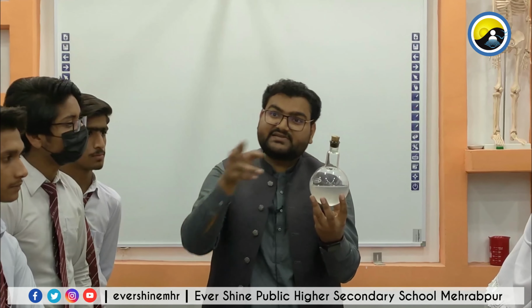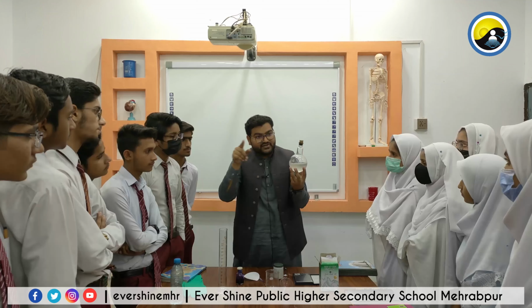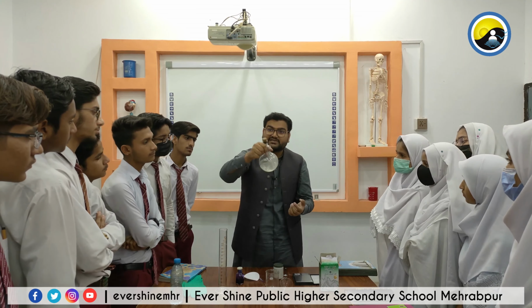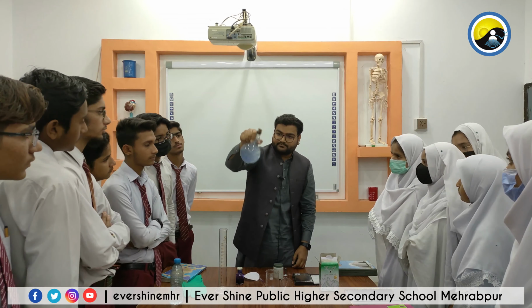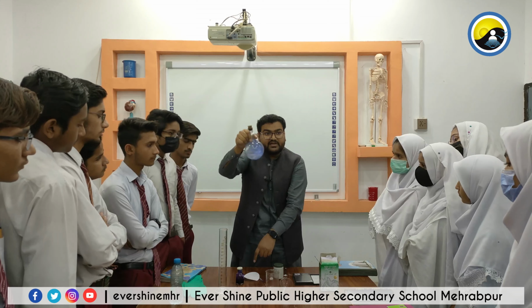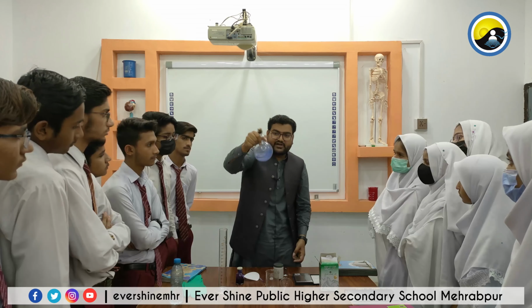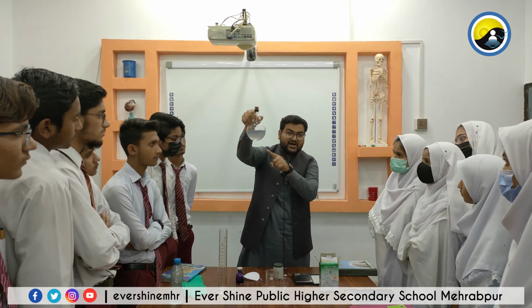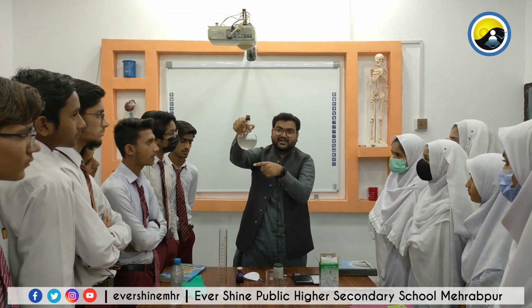So both reactions are taking place in the same solution, reduction and oxidation. Reduction is happening when the solution is colorless, and oxidation is happening when the solution is blue. With the help of methylene blue, we were able to find out when oxidation and when reduction is happening. If the solution color is blue, it means oxidation is happening. And you will see the glucose is again reducing and the color is becoming colorless.